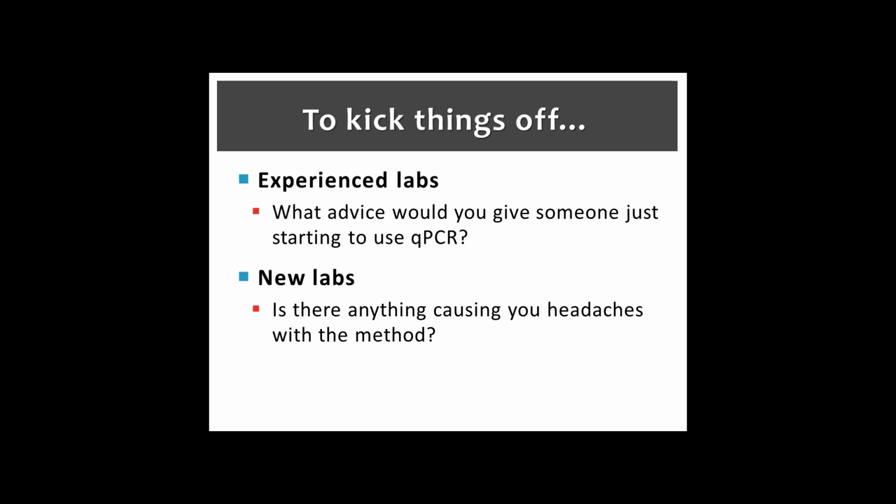So here we go. We know that if you have algae, it's going to interfere a little bit with the signal. You'll get an amplified signal. So some of our beaches are going to have a little bit more Cladophora, maybe a little bit more stuff in them, a more complicated matrix. Some of them are going to have very nice water samples, not much stuff floating in there. That's all going to make a big impact. And so that's where this might be a decision. If we only need 80 to 100 samples, I don't think we got enough this summer.